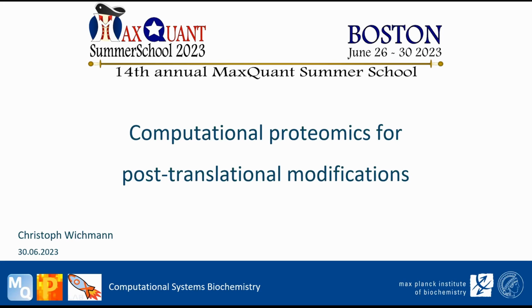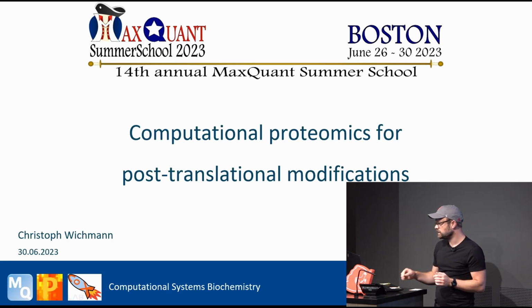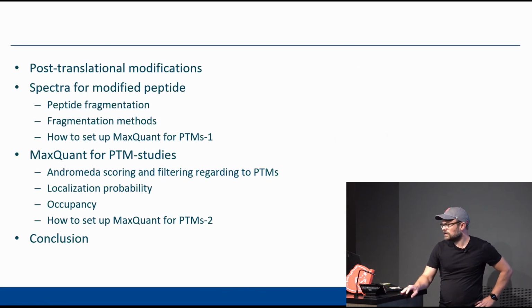Hello, everyone. I will now talk a bit about computational proteomics for post-translational modifications for roughly 40 minutes, and then Carlo will take over and show you how to work with these data in Perseus. So that's the outline for this talk.